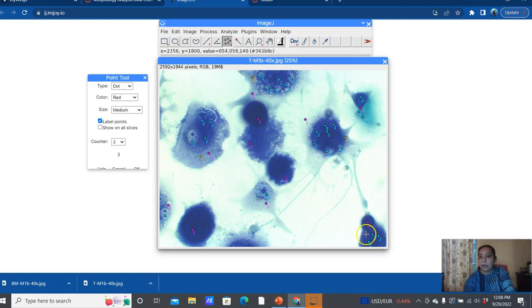And I'm going to mark them. This one. I already did that. This one over here had multinucleated. So those would be the ones that have multiple nuclei. And then once I've marked those cells, now I have this image completely done with all of the observations that I wanted to do as far as counts are concerned.